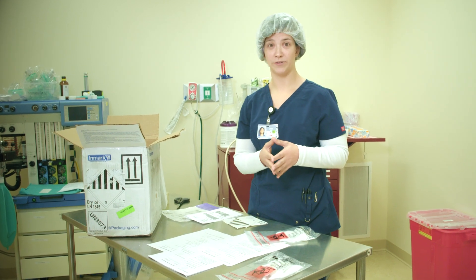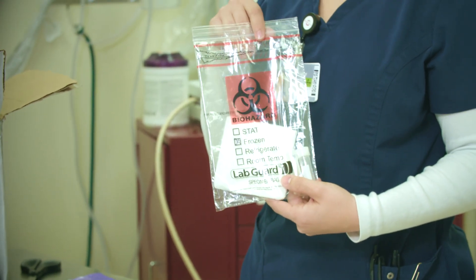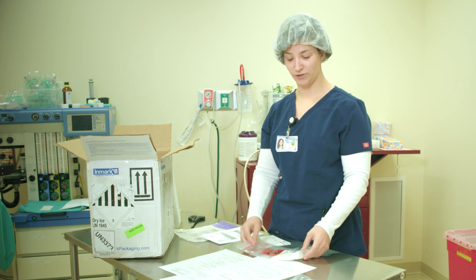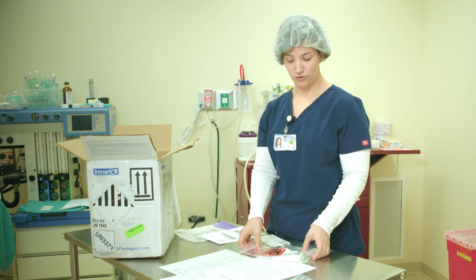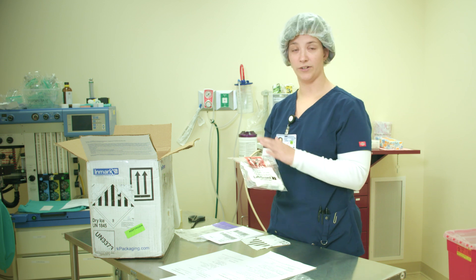Once you gather all your samples, whether it be on dry ice or from a freezer, you can place them all in a single biohazard bag as long as that bag is able to lay flat. You could have 15 to 20 samples in one bag as long as it's laying flat.